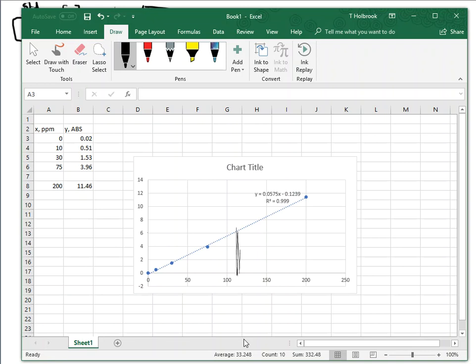There, on over to the line, I'll be able to get the concentration that's present. Well, that's estimation. We're better than that. We don't have to estimate things. I mean, that's the purpose of this equation right here.